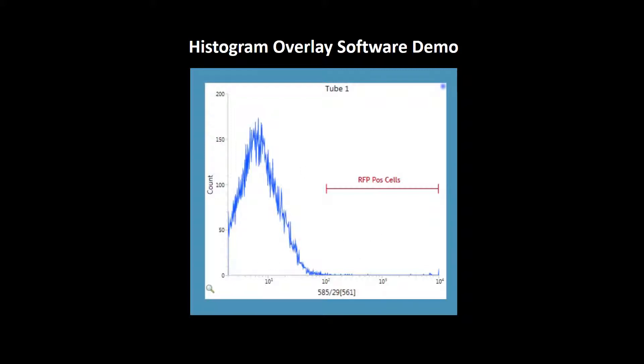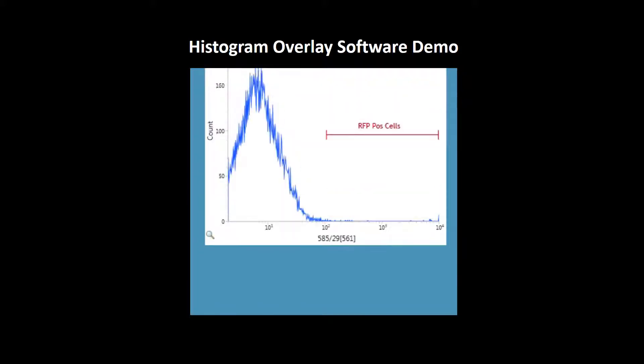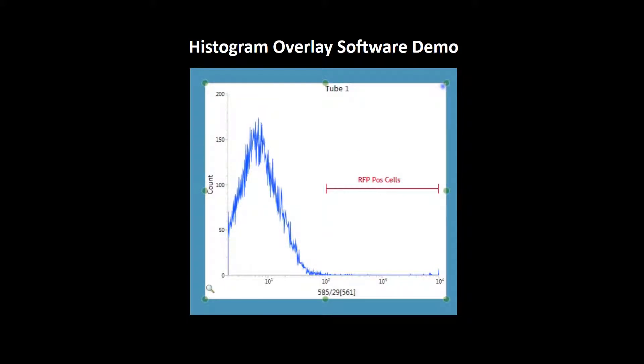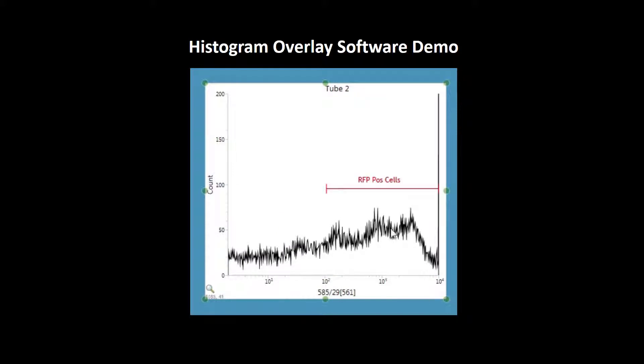I will just check whether I have RFP positive cells in this region or not. Okay, I have RFP positive cells here. I want to show in the same plot that this is my unstained cells and this is my RFP positive cells.